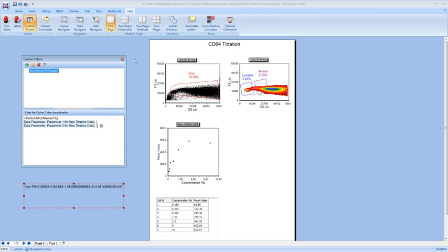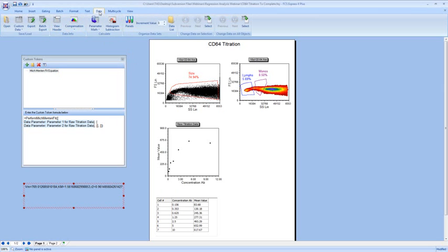So to do this, let's insert a new custom data, and we'll call this Michaelis-Menten regression overlay. We're going to do 2 columns because we want one column for concentration or x and one column for mean or y. And then since we want to go from 0.1 to 12, and we want to do that in, say, 0.1 increments, we're going to insert 120 rows into this custom data here. And let's open the data grid after we create this.